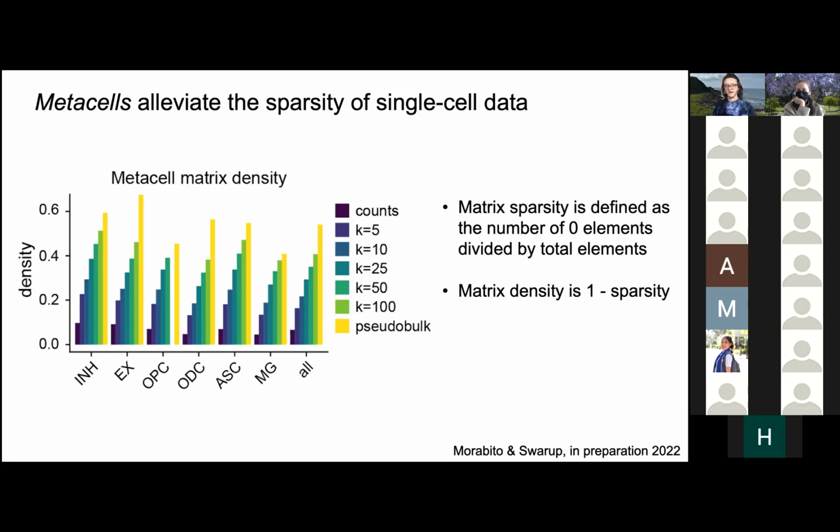You're going to be doing WGCNA separately for each cell type. So let's say in this data set, we want to do it for all 6 cell types. You can just use the same meta cells, but if you actually want to use a different number for each cell type, you totally can. Okay, cool. I just haven't done it that way, but the software does allow you to do that for sure. Cool, thank you.